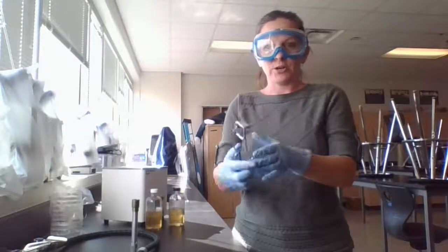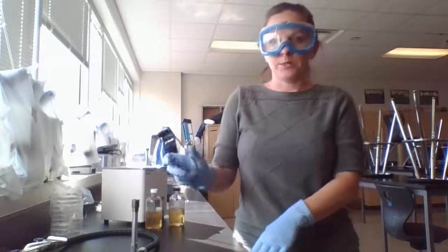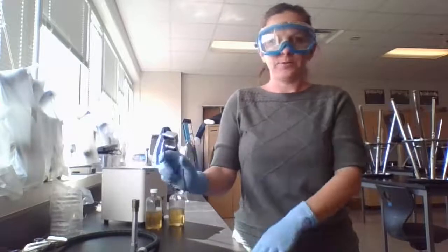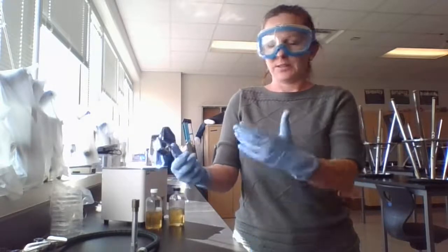All right. So this is called a striker. We're going to be using this to light our Bunsen burner. Basically what it does, it's got a little piece of flint and when you click it, it makes a spark.